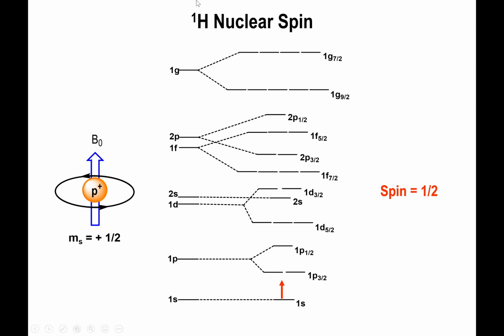So let's say you have a regular proton. So this is hydrogen with only one proton. There's no neutrons in there. Well, what will happen is that for your proton, you will just input that particle on the first box of this diagram. And because that's the only thing you have in here, that occupancy is worth 1/2 spin.